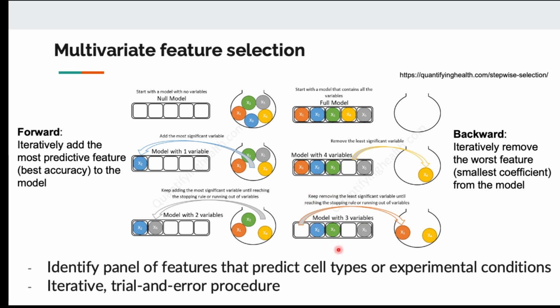So in this process, there will be a certain point where everything that you have left is important. If you remove some of them, you're going to lose the ability to distinguish the cells. So at a certain point, you will stop removing columns, because once you remove the next column, your ability to distinguish cells decreases. So this process has well-defined steps, what to do, and a well-defined stop criterion, like when to stop doing this.